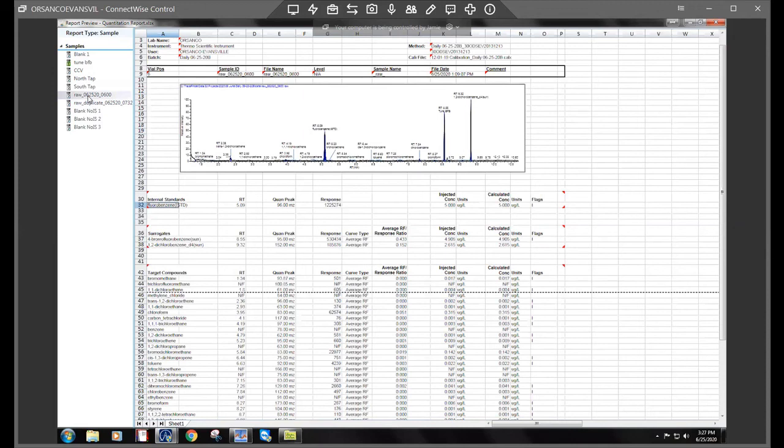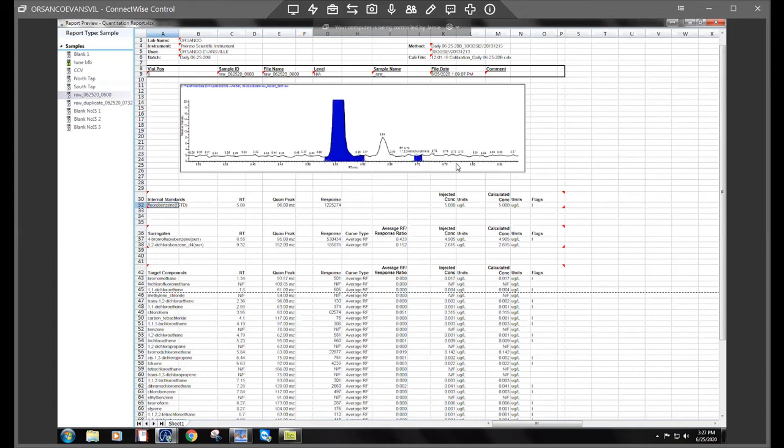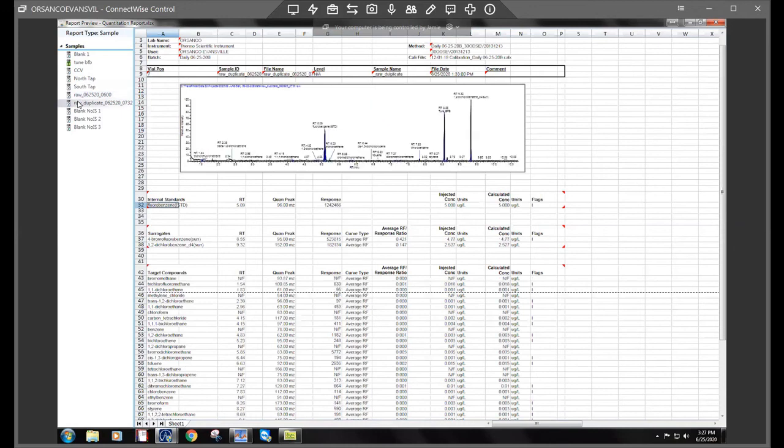If those two don't really work to get it out, it could also be in the trap and the Purge and Trap, but I would assume it's within the column. Probably the latter end of the column might need a trimming since they're pretty heavy compounds coming off this late.